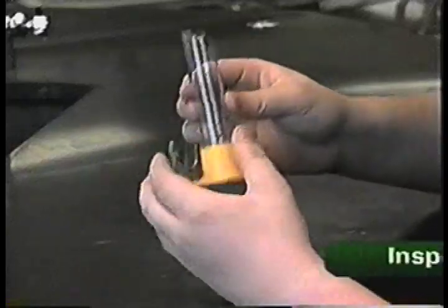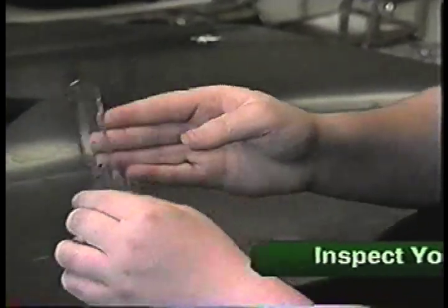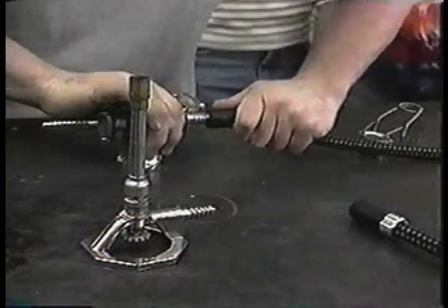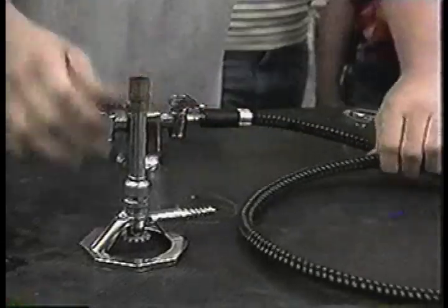Take a close look at any beakers or other glassware before you use them. If they're broken, chipped, or cracked, tell your instructor and get another beaker. Electrical cords are not supposed to be frayed. Don't use any tool with a bad cord. Hoses should be free of holes or other wear. Don't turn on the gas if there is damage, and be sure to report the problem immediately.